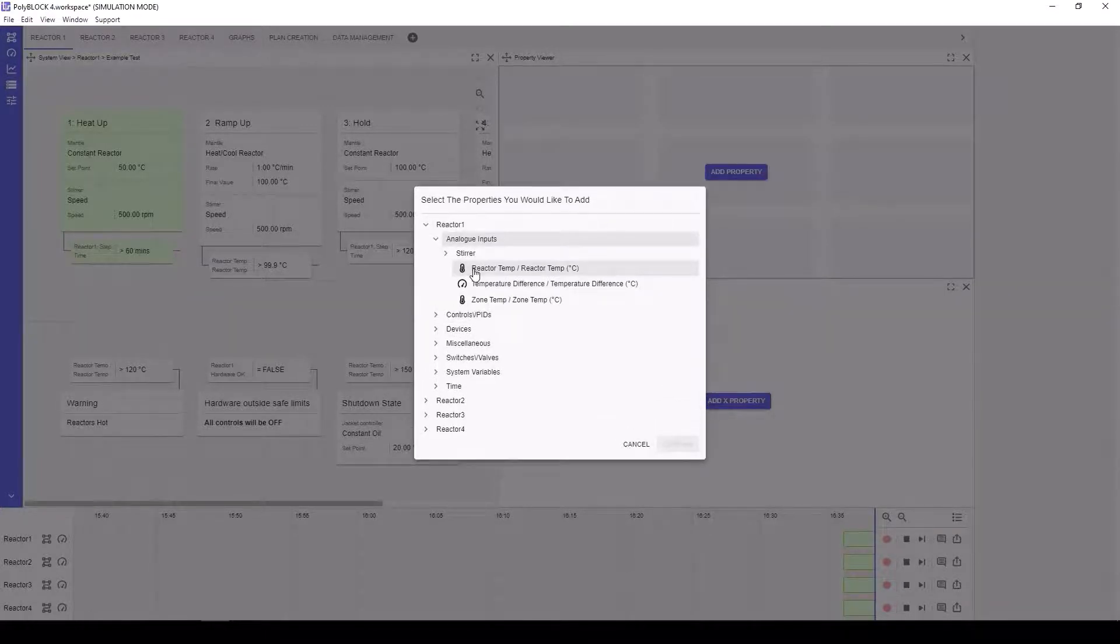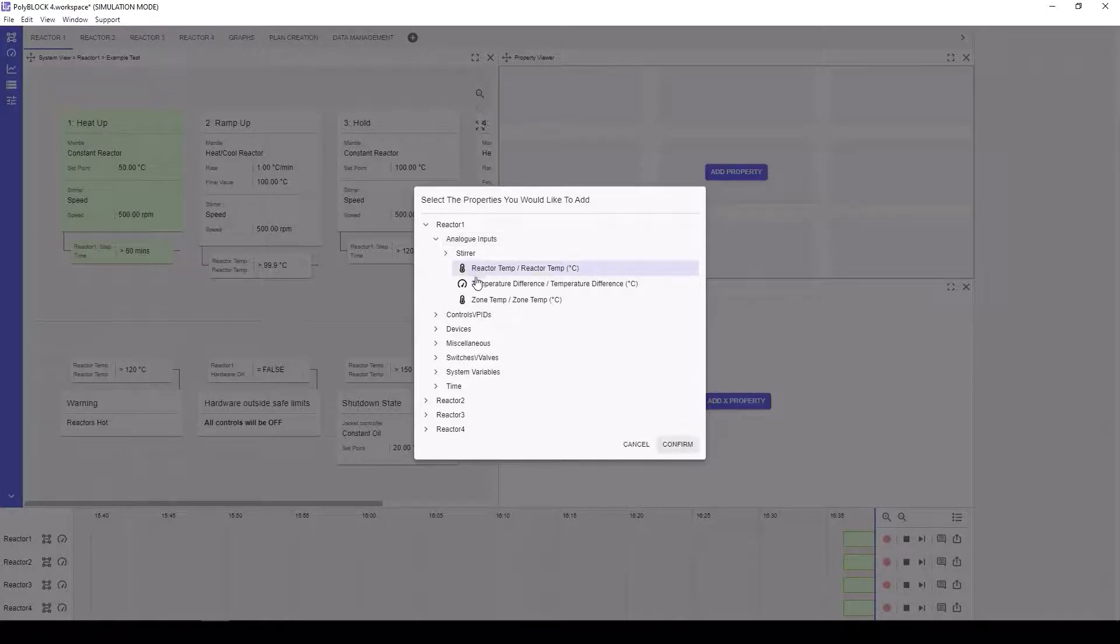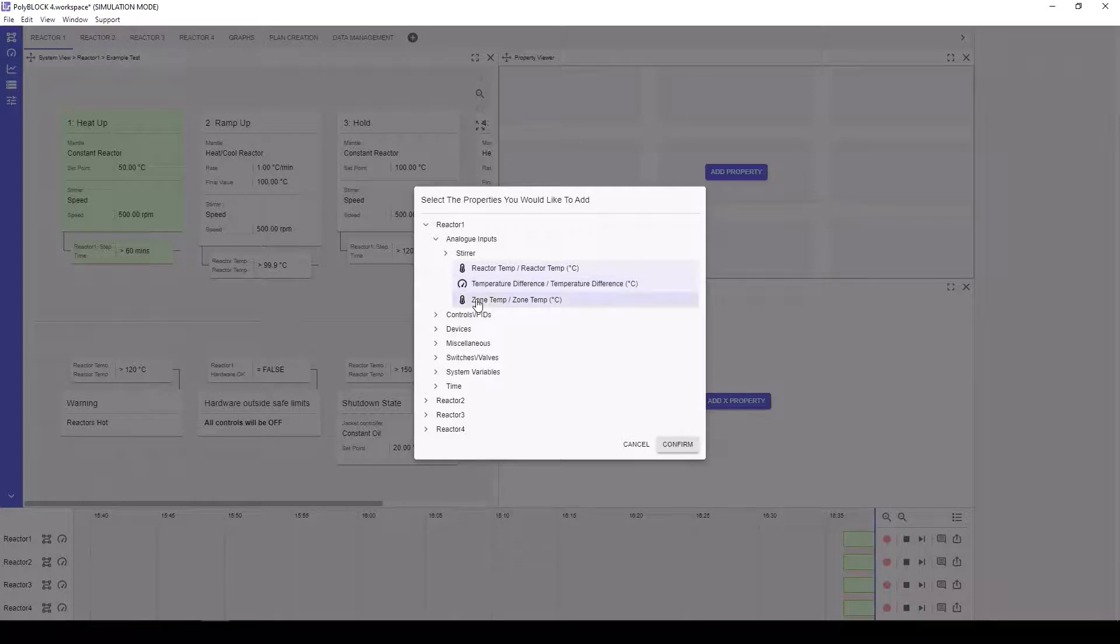Expanding the tree will allow the end user to find the property that they want to display. Multiple properties can be added simultaneously by holding the shift or control keys.